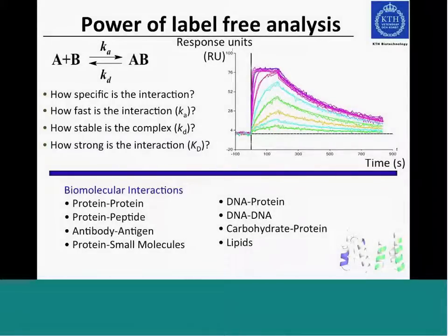And you can use this for plenty of biomolecular interactions. We work mostly on protein-protein interactions, but you can also look at peptides or small molecules, DNA, carbohydrates, lipids, etc. But the focus here will be on protein-protein interactions.